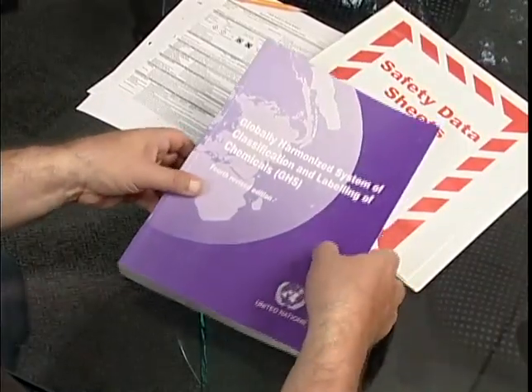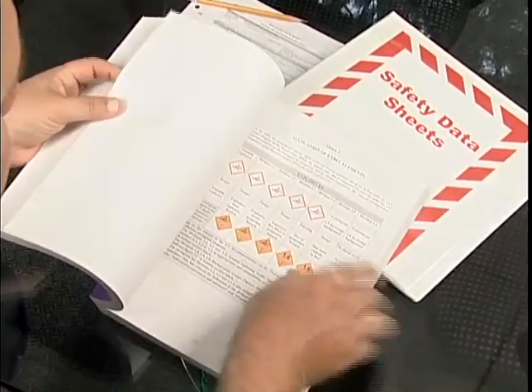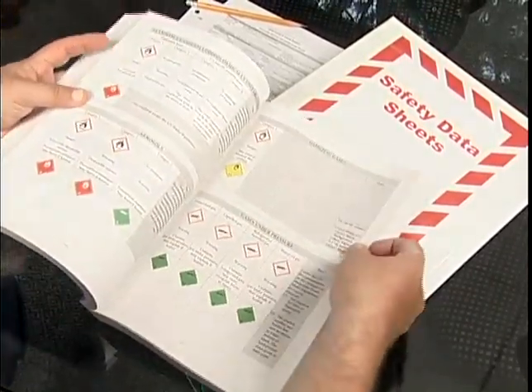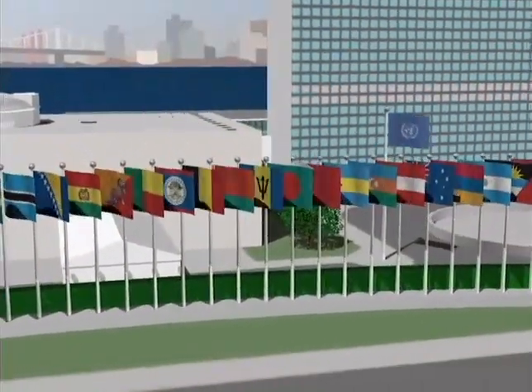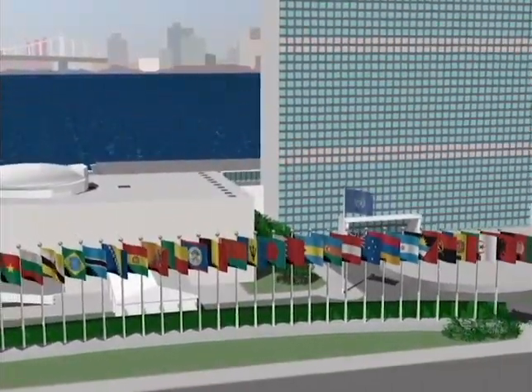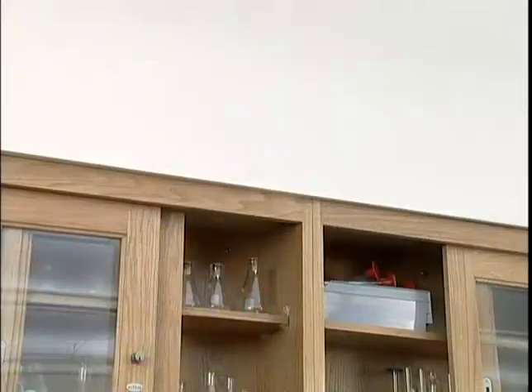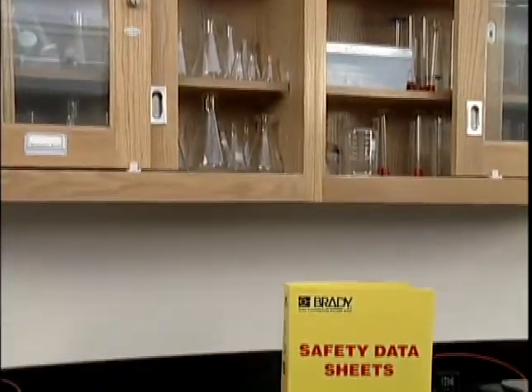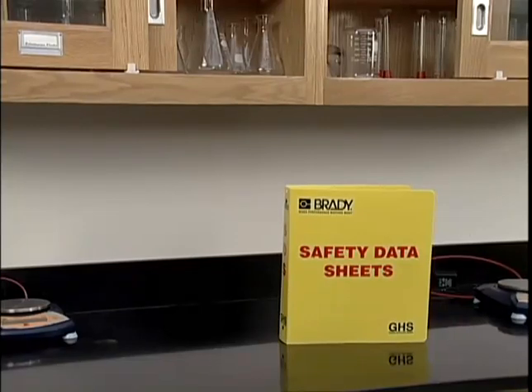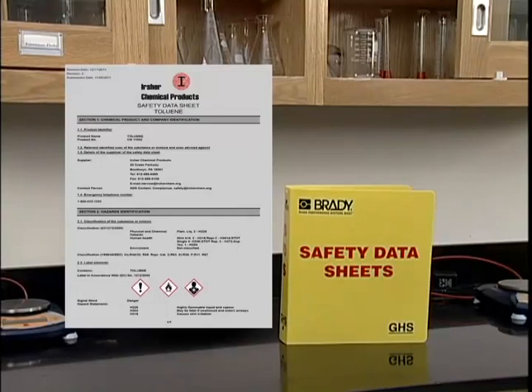To address these problems, OSHA has adopted the Globally Harmonized System of Classification and Labeling of Chemicals, GHS for short, into the HAZCOM standard. The GHS was developed by the United Nations so that workers anywhere in the world would be able to understand the hazards that a chemical presents. A major part of the globally harmonized system is the use of the GHS Safety Data Sheet. It gives chemical manufacturers a standard format and specific, understandable language to use to describe a chemical's hazards.